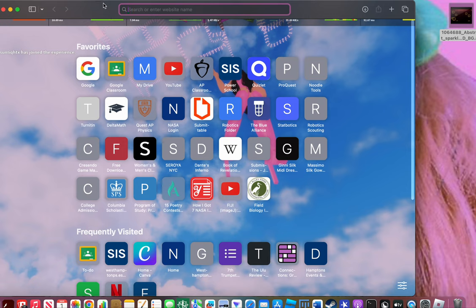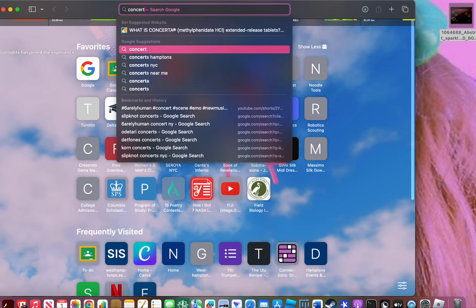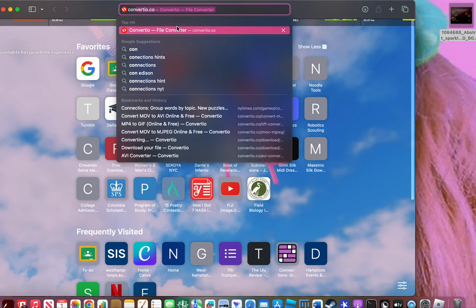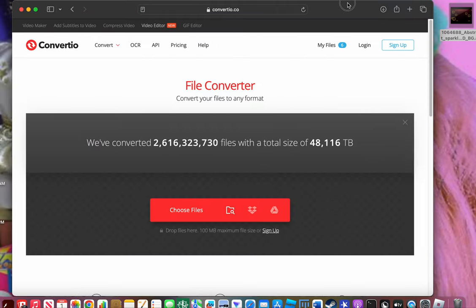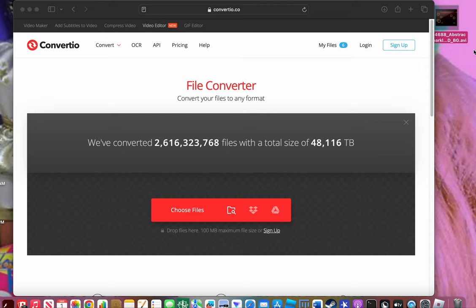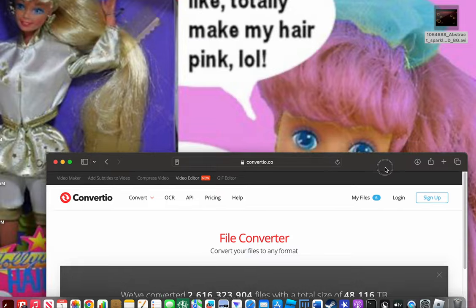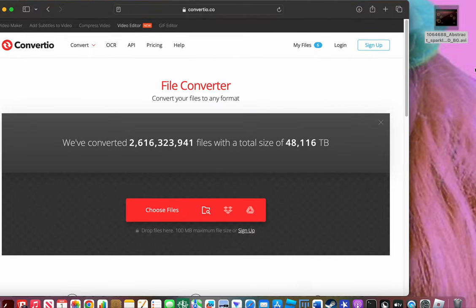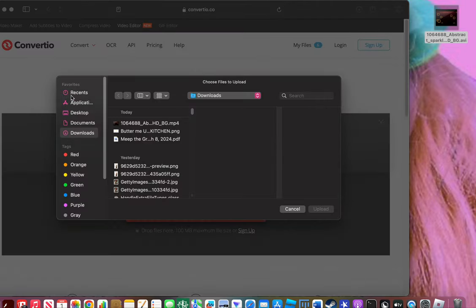This is for any kind of small movements that you want to be tracking. So first, if your file is in an MOV file, the first thing you have to do is convert your file. We're going to be using Convertio. The extension you have to have for Fiji or ImageJ has to be .avi.